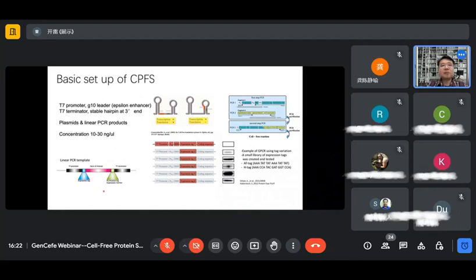So as long as the promoter sequence and ribosome binding site are present upstream of your gene of interest, this would be the only essential part that you need for expression in cell-free systems, which means you can really run a large number of expression reactions in parallel. For instance, if you want to study a mutation effect, or if we want to create a library of mutations for a particular protein, this is really helpful, as you can skip the cloning step totally.